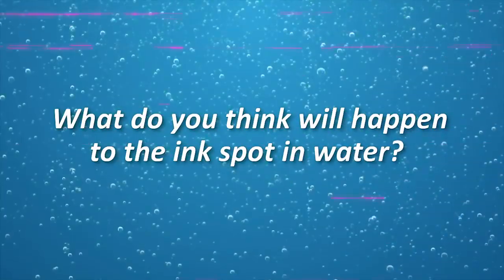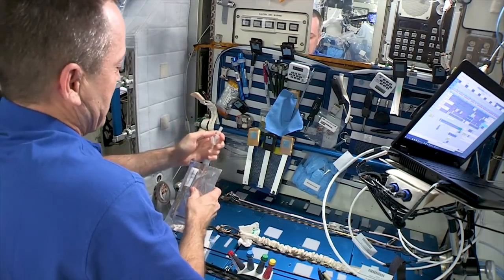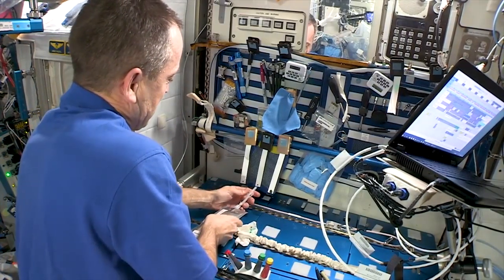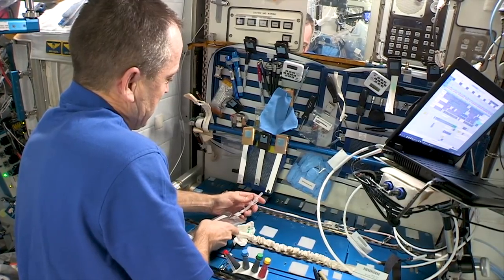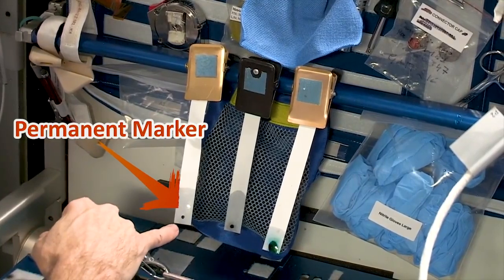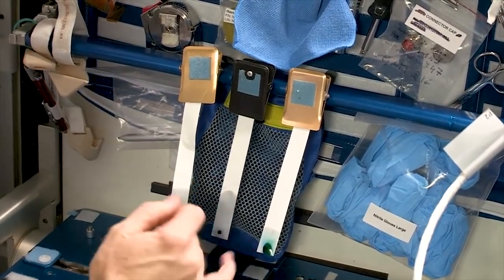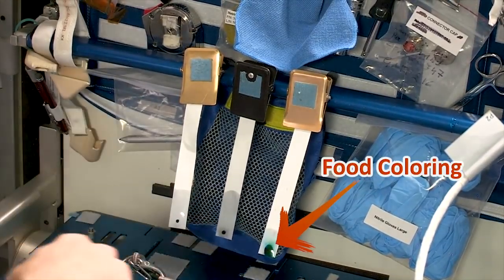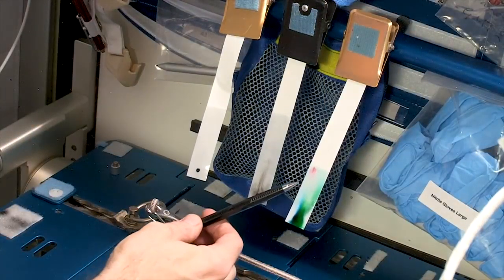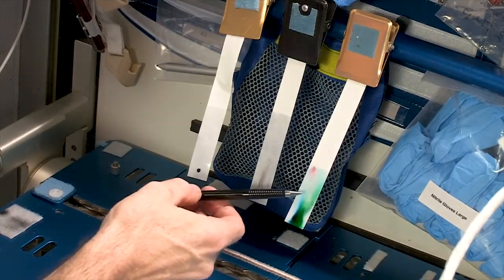Talk about it with your classmates. All right, now let's see what happens. I'll go ahead and add some water. The water is going ahead and creeping up the chromatography paper. You can already start to see some separation. Very little on this black one, but you can actually see the reds, greens, and yellows starting to separate and make their way up the chromatography paper. The substances now in liquid form travel over the solid — the paper — at different speeds, causing them to separate into the component parts.